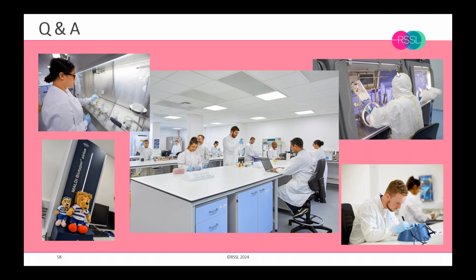And then I've got a question from Taran, who's asking, how often should risk assessments be revised? Again, I think it depends on the size and the complexity of the facility. But the important thing is risk assessments don't sit on the shelf and gather dust. They are dynamic. So often the change control mechanism can be a good one to flag the need to review. But even if nothing appears to have been changed, then to look at these things at least every 2 or 3 years would be important.